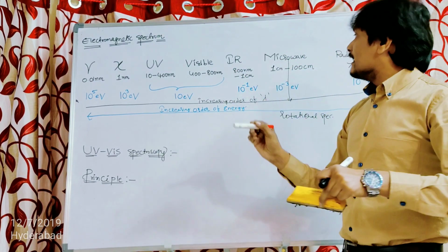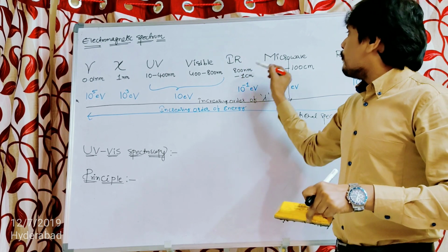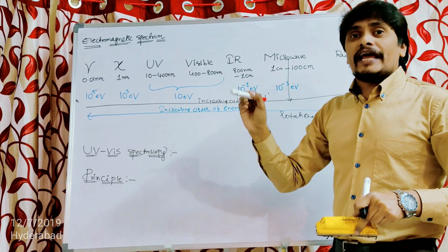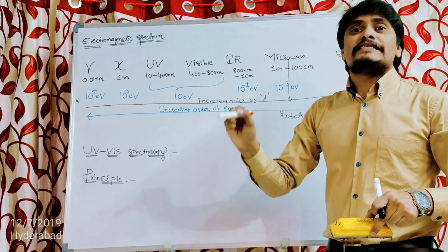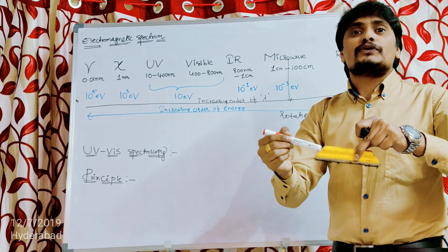Why? Because the energy associated with infrared radiations is more when compared to microwave radiation. So rotation followed by vibration of the molecules takes place in the sample whenever the IR radiations are passed through the sample.